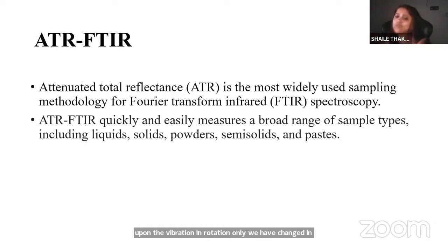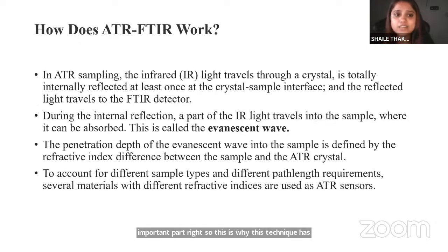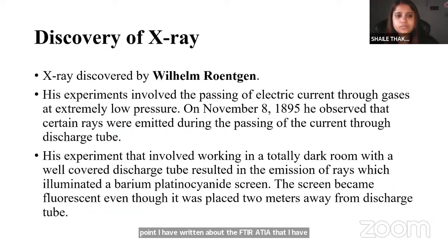The principle is the same, but we have introduced some important parts, right? So this is why this technique has become a very advanced technique. These are the basic points about FTIR ATR that I have already discussed, right?